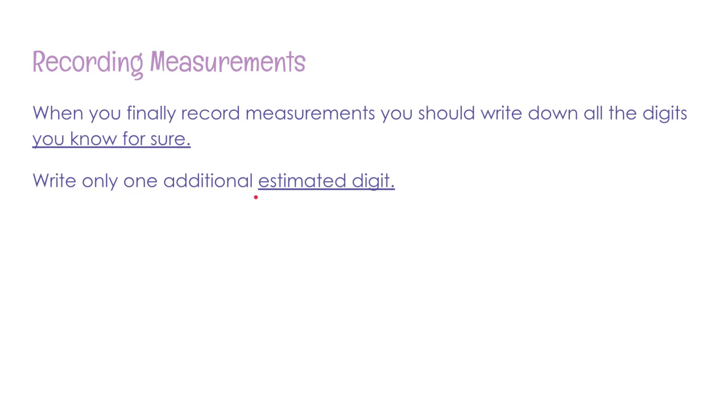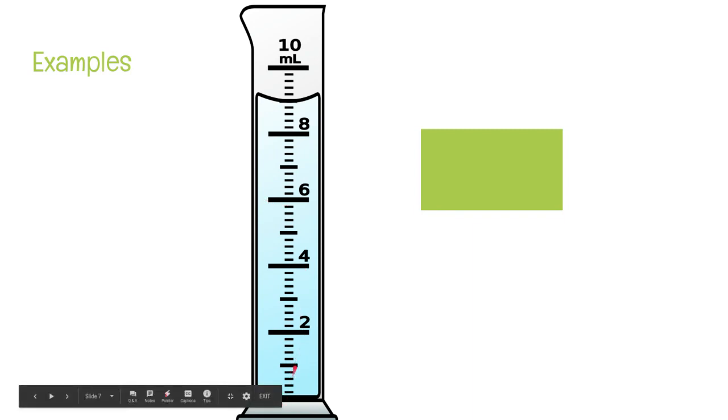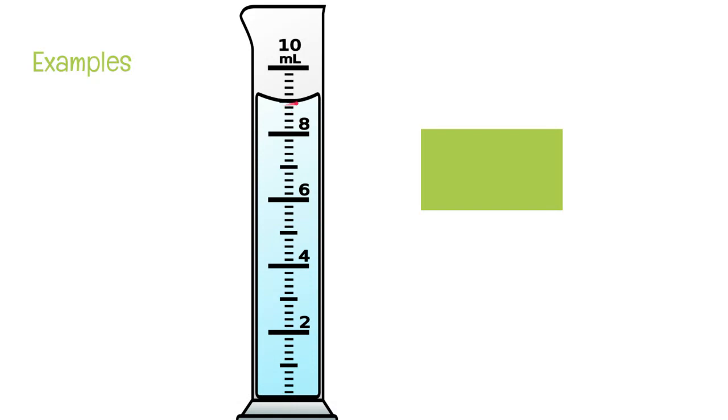Now, this sounds kind of silly until you see an example, but I'm giving you the rules first and then some examples. So we're going to write down everything we know for sure and estimate one digit. Here's what that looks like. Here we have a graduated cylinder. It's counting by ones. Each of these dark lines is 1 milliliter. So we go 1, 2, 3, 4, 5, 6, 7, 8, 9, and then 10.